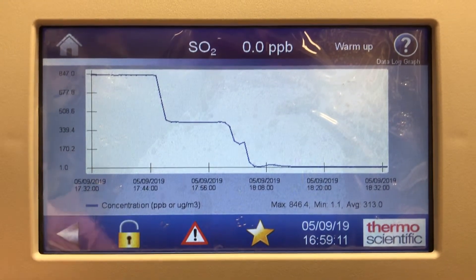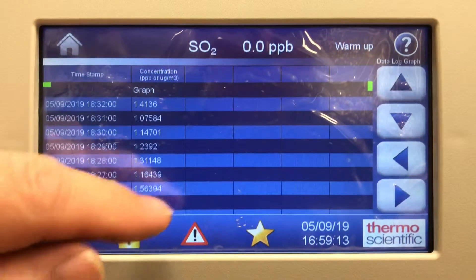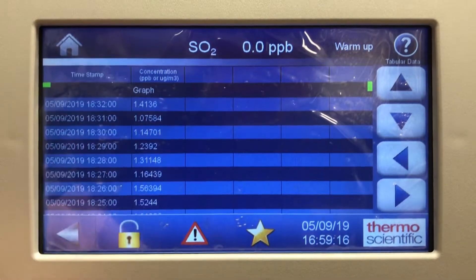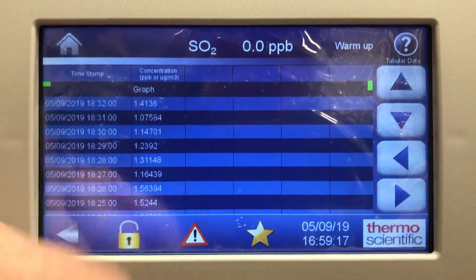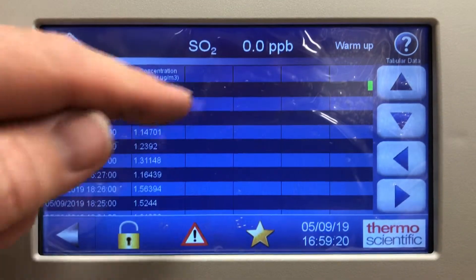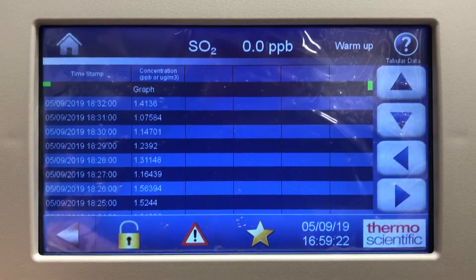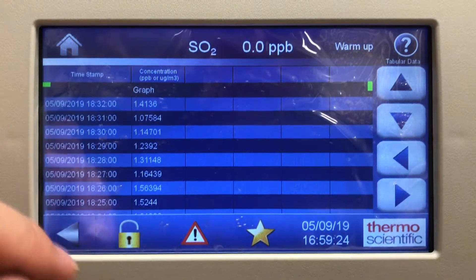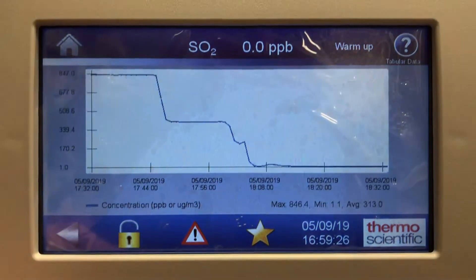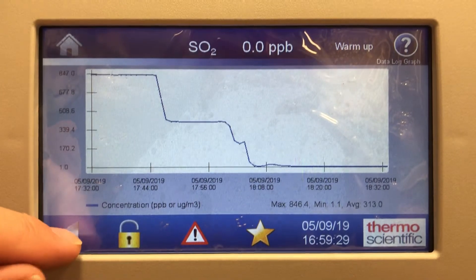You can do that with other columns too if they were set up for temperature, flash lamp, flow, or pressure. You can have all these columns populated and touch the word graph to view them as well. It's a great feature to watch what's going on as you're calibrating the unit.